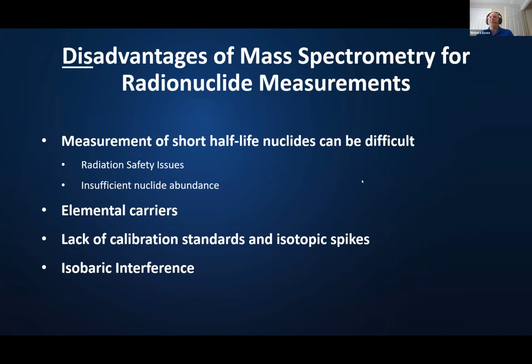Yeah, and I think for things with moderate half-life, something like cesium-137, where you've got a 30-year half-life, it's not decaying away so fast that you can watch it while you're doing mass spectrometry. But over the course of years, that uncertainty in the half-life is starting to blow up the uncertainty in the isotopic ratio as more of it decays away.